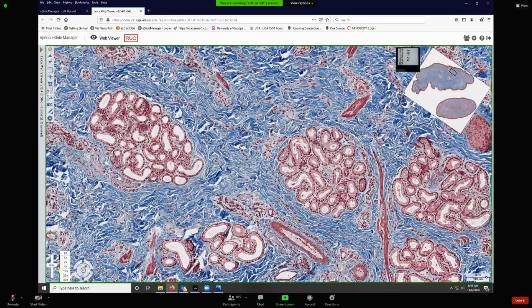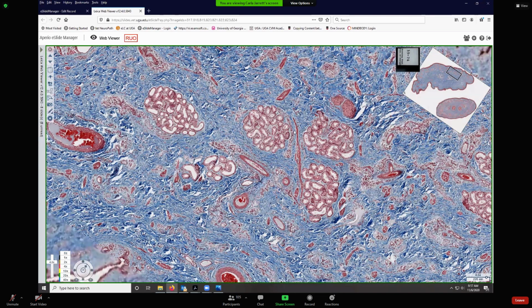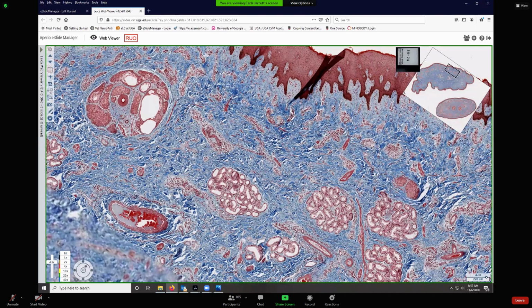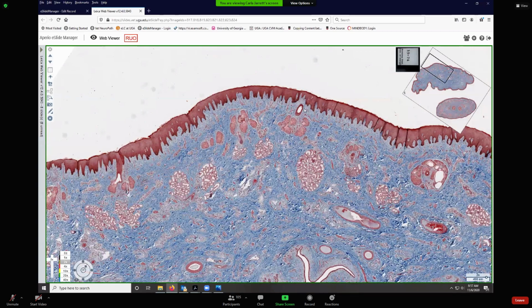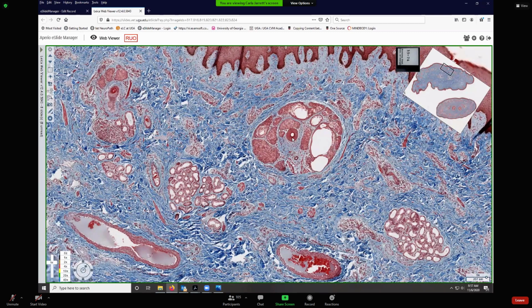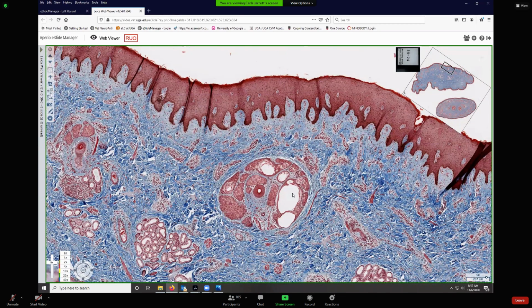So look at these massive piles of simple tubular glands that are all just coiled up in a tight cluster. Here we've got some smooth muscle fibers. I think those might be some of the erector pili muscles. And here you've got sebaceous glands. You've got some fine hair follicles because the mare teat does have really fine, small hairs. So here we've got little follicles invaginating in. You can see the sebaceous glands crowding around that hair follicle because they're lazy. They just want to secrete into the hair follicle lumen instead of having to make their own duct to empty out onto that skin surface.